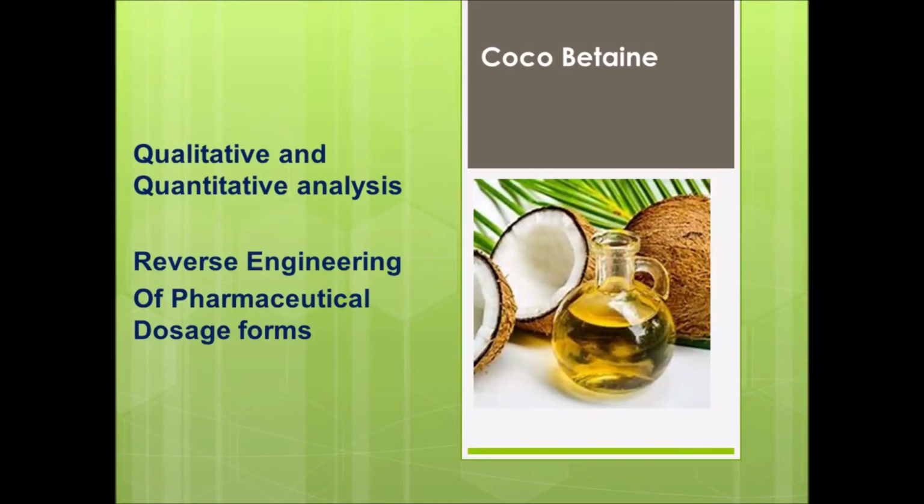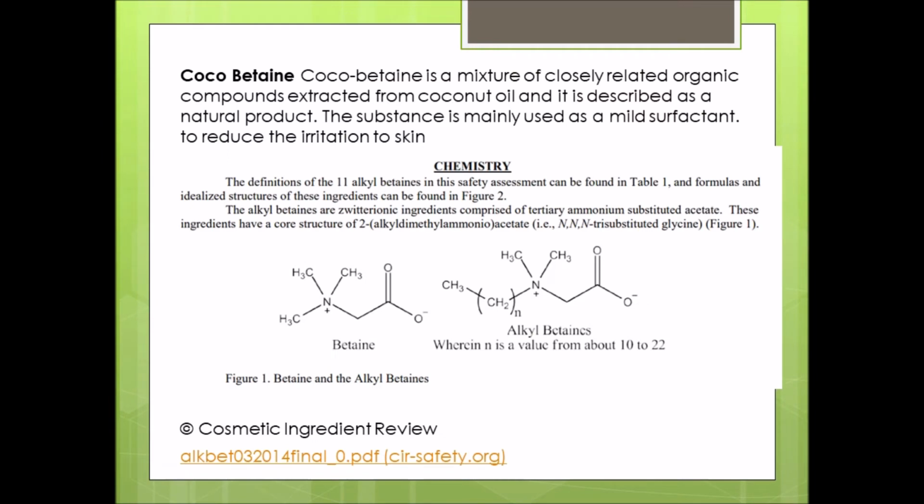Hello again. So I'm going to talk about the qualitative and quantitative analysis of Coco-Betaine in pharmaceutical dosage form or in personal care products. First of all, the Coco-Betaine is a very mild surfactant, and it is usually used in formulations for infants, like baby shampoo, because it does not burn the eye, as I said before.